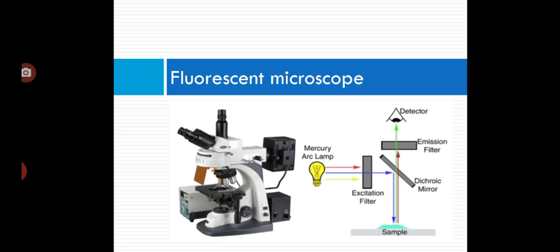Microorganisms in a specimen can be stained with a fluorescent dye. On exposure to excitation light, organisms are visually detected by the emission of fluorescent light by the dye with which they have been stained. Bacteria stained with fluorescent dye become visible as brightly glowing objects against a dark background.